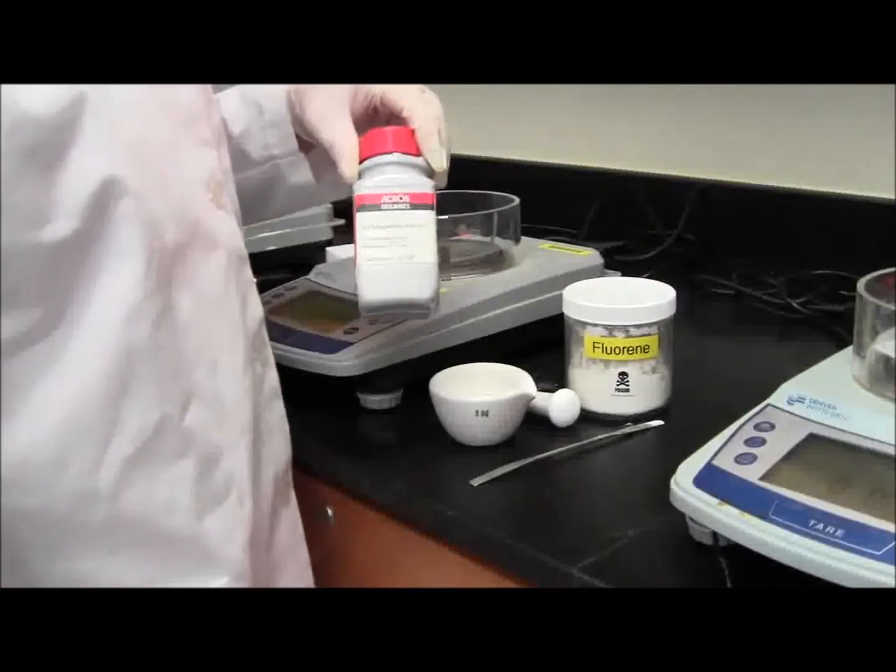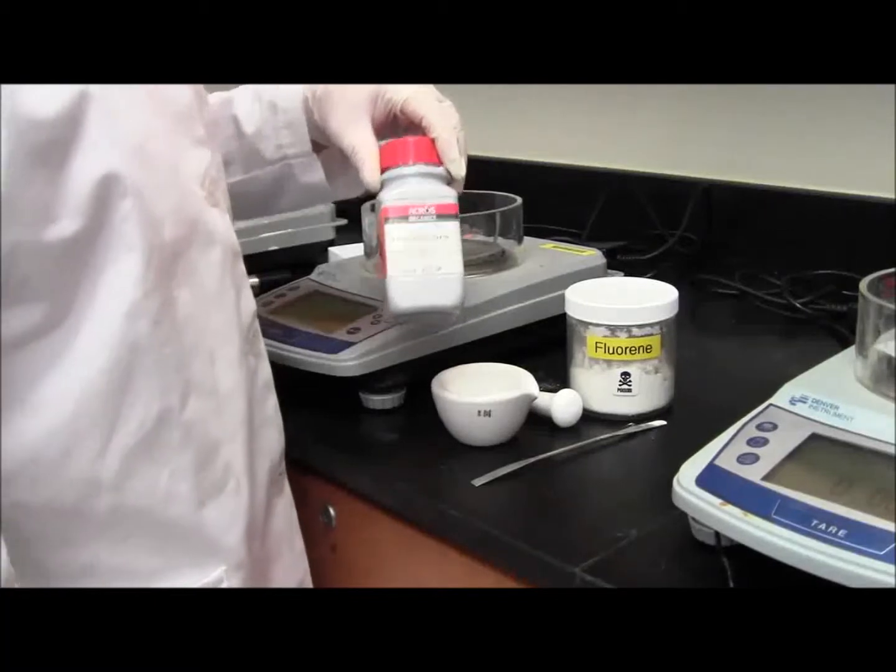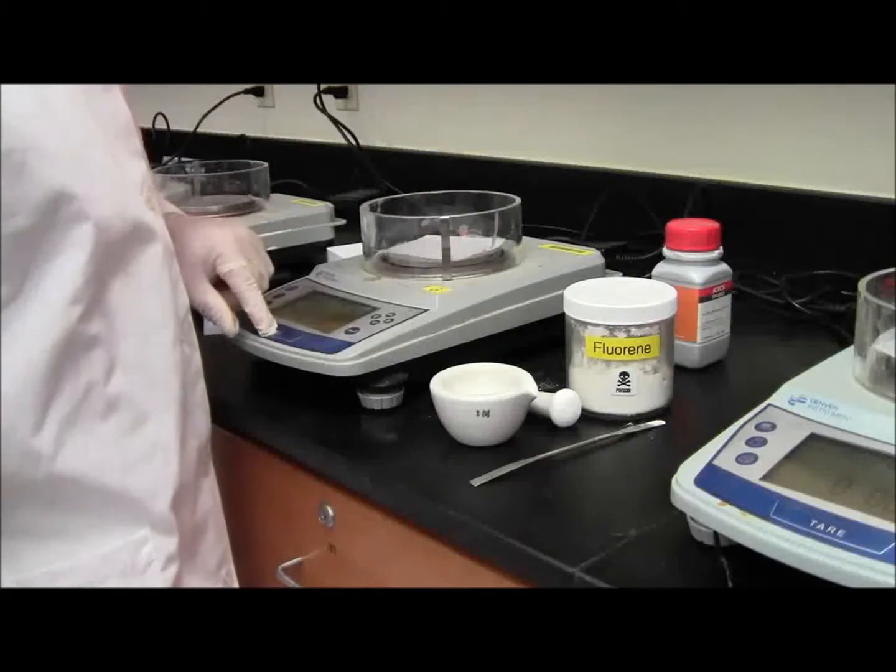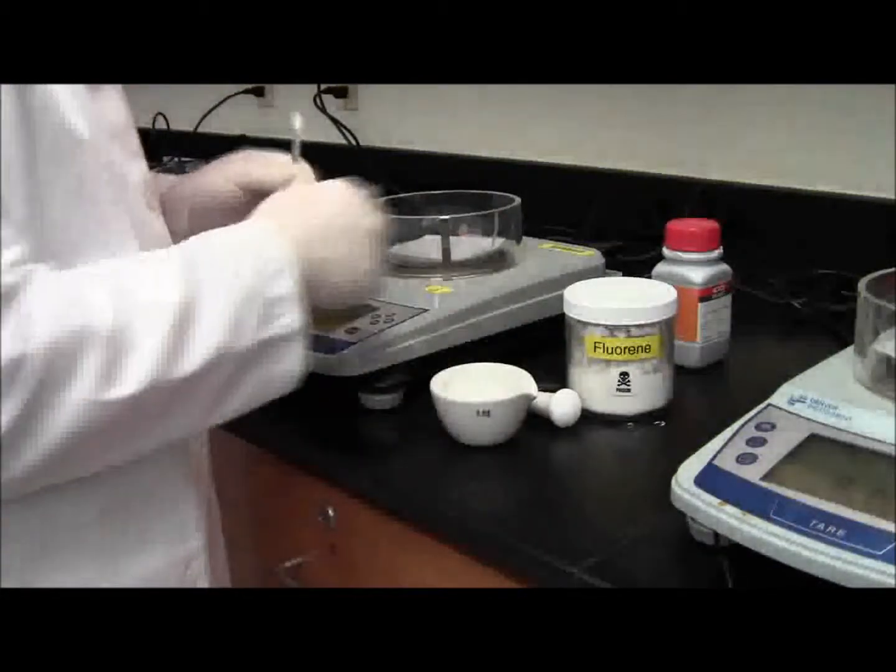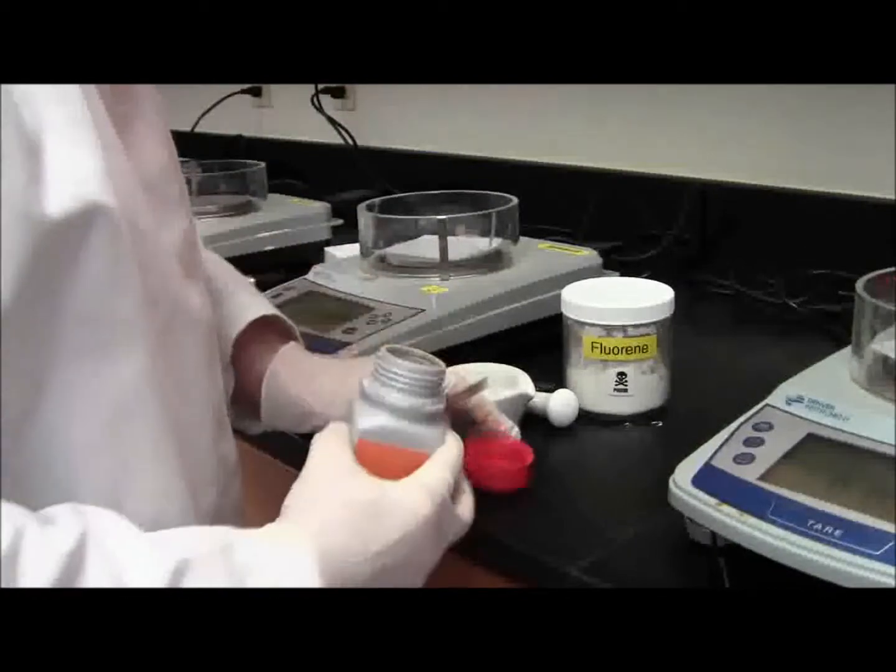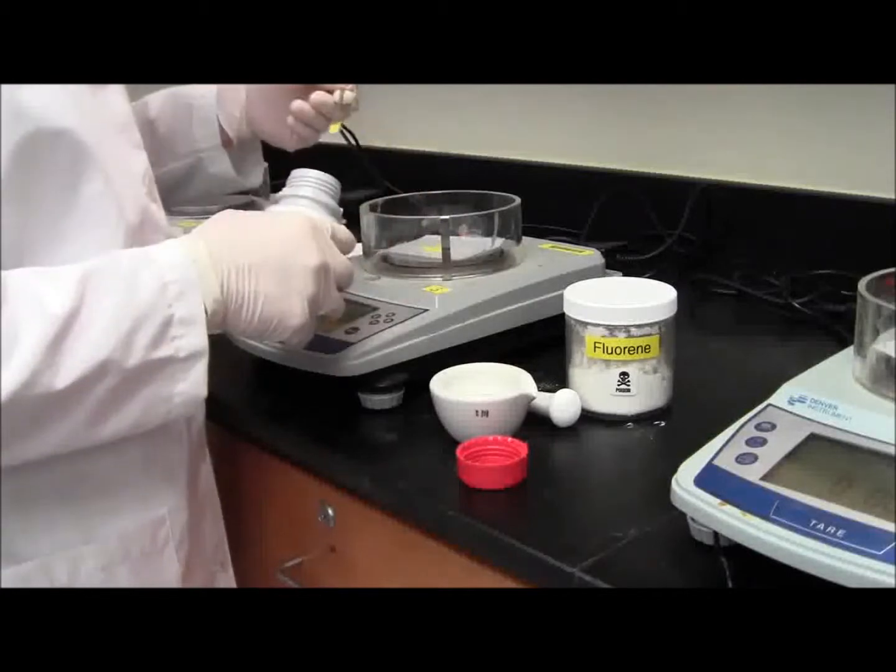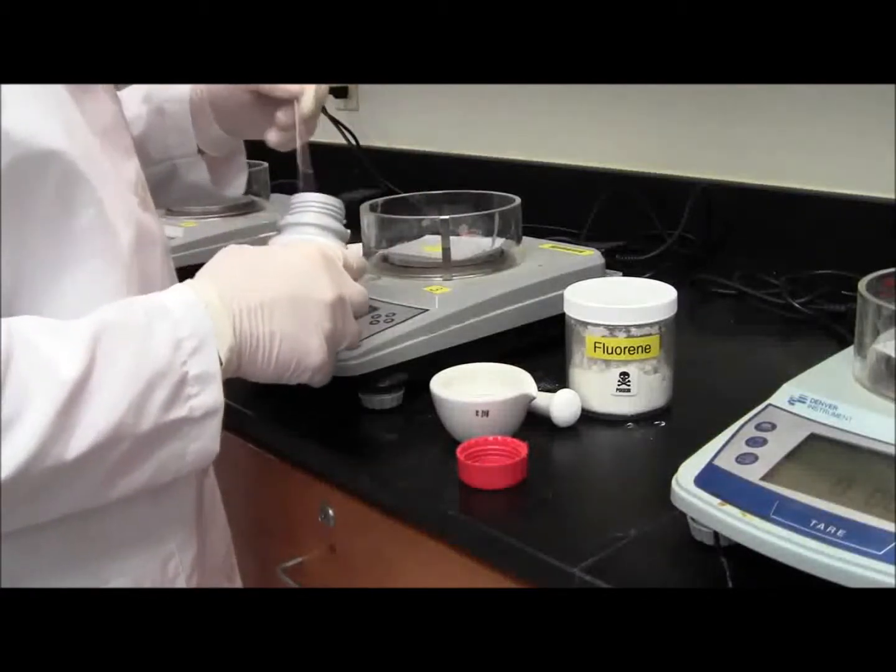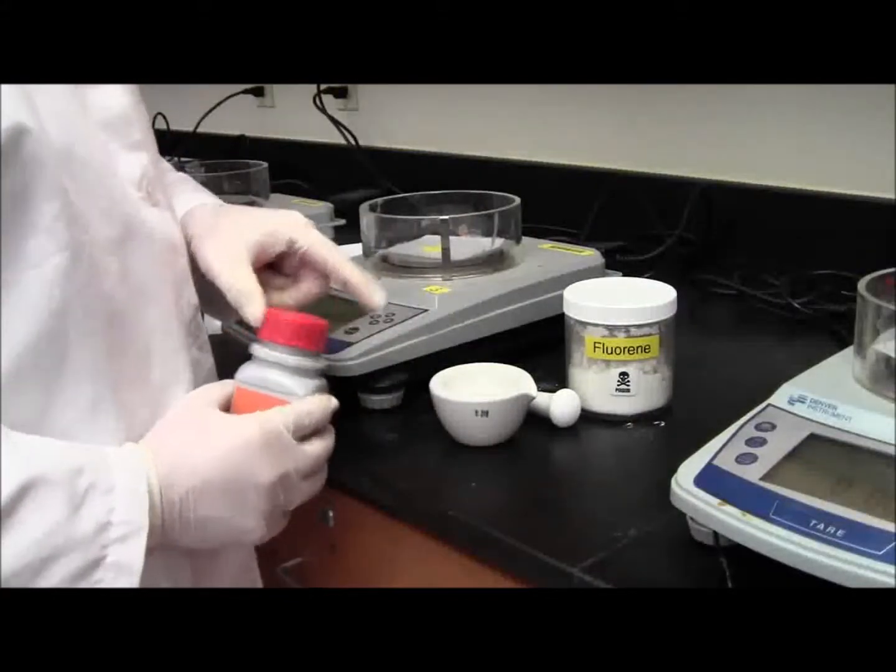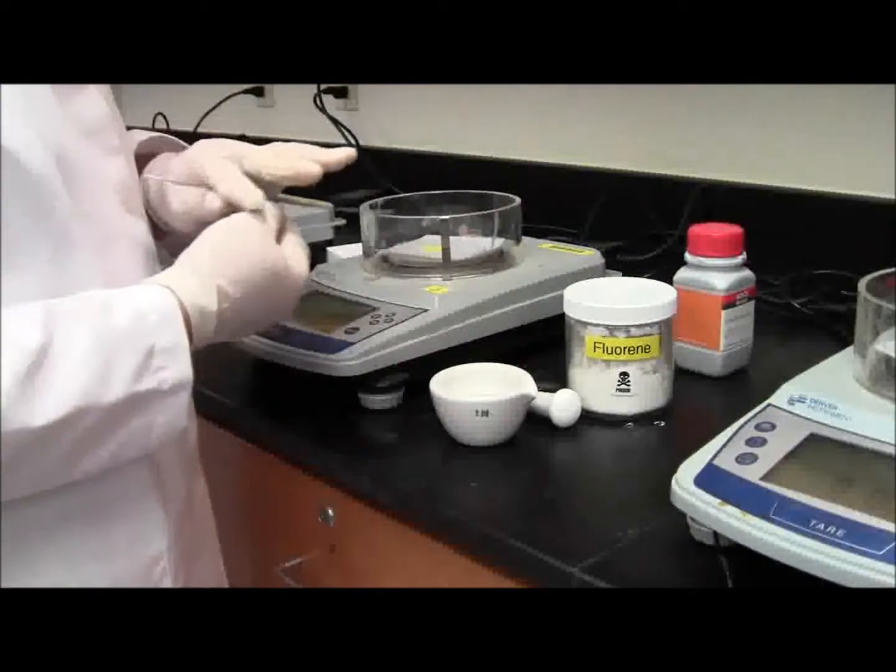Now we're going to weigh out 0.05 grams of the fluorenone. Take the weighing paper, tare it. And I got 0.06 which is pretty close. Remember to write down the two weights in your lab book.